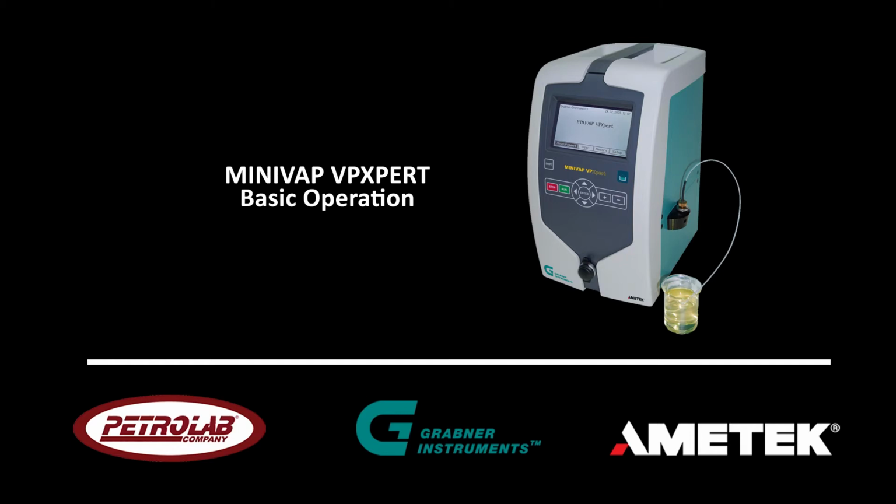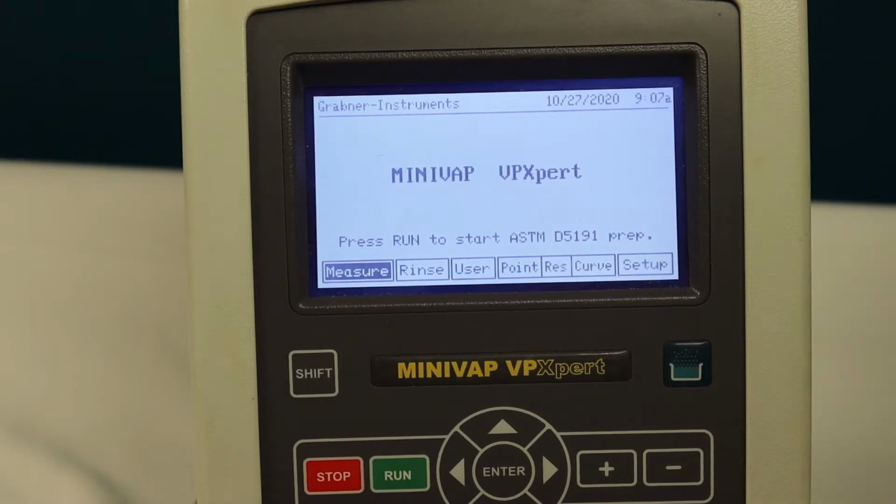Today we're going to be giving a brief overview and a review on the operation of the Grabner VPXPERT and their latest generation instrument, the Grabner VP Vision. First, we're going to start with the Grabner VPXPERT.